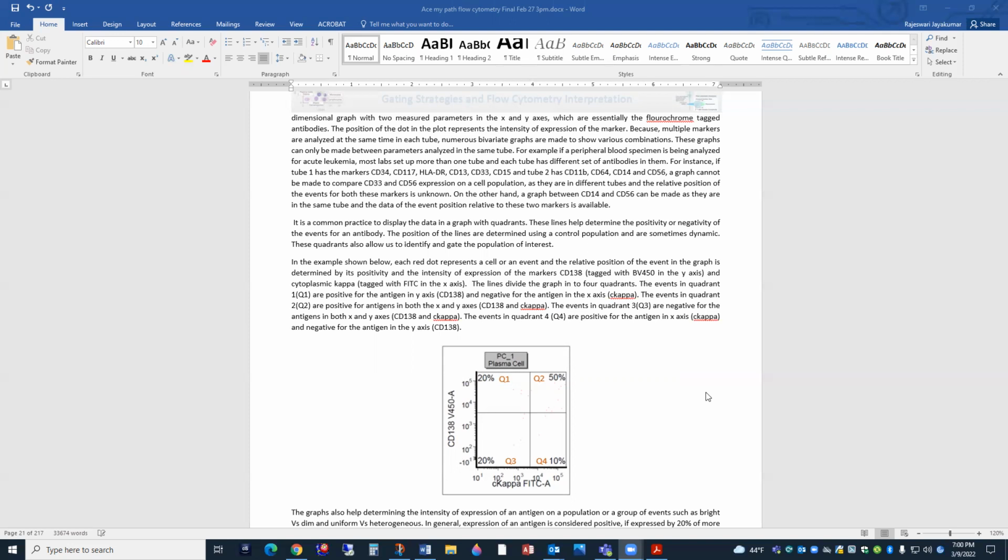So basically, let's say your flow cytometer has the ability to analyze 8 fluorochromes at a time. That's what we commonly call an 8-color flow cytometer. We have different color flow cytometers. We have 10, 12, 16, 18. It has gone so wide these days.